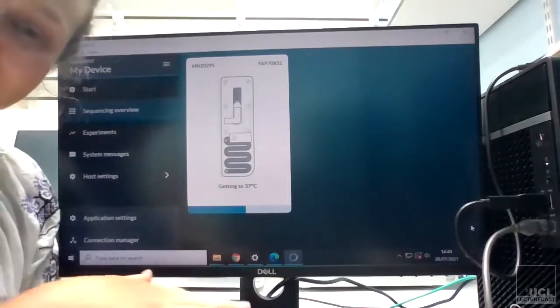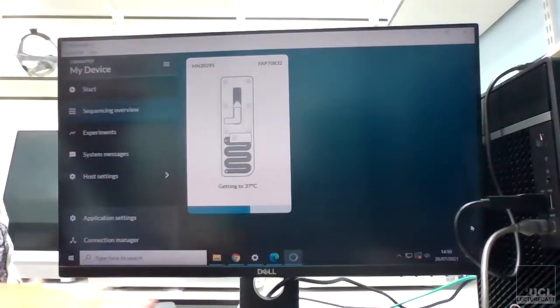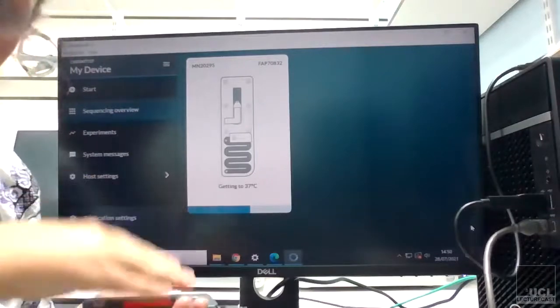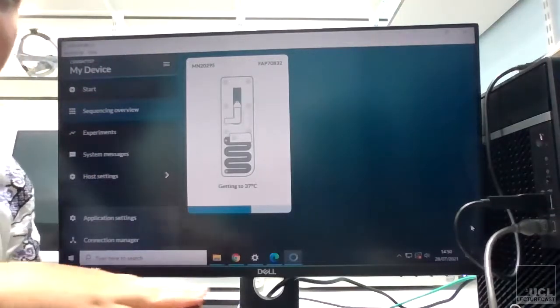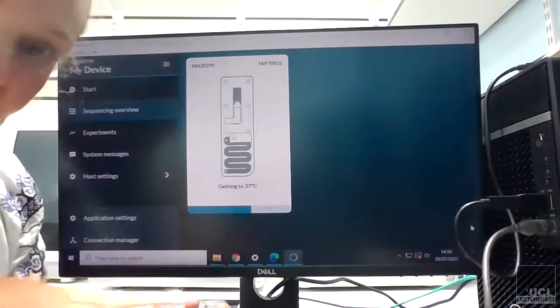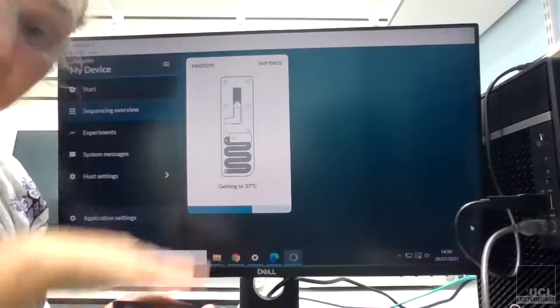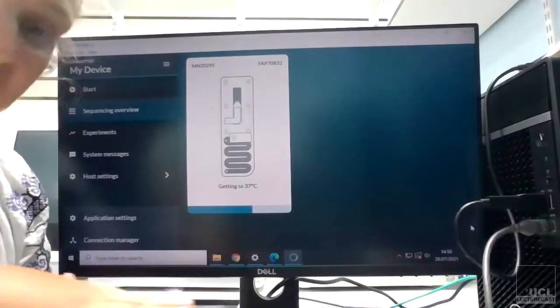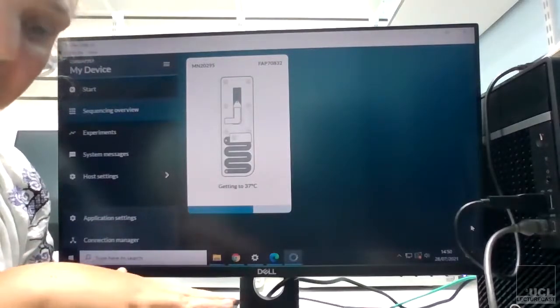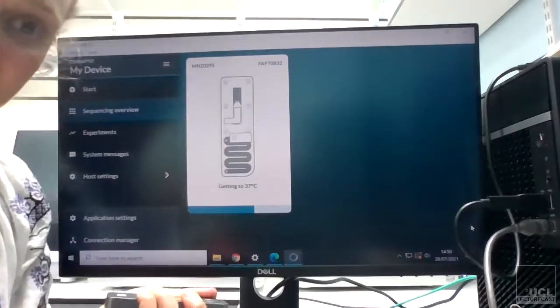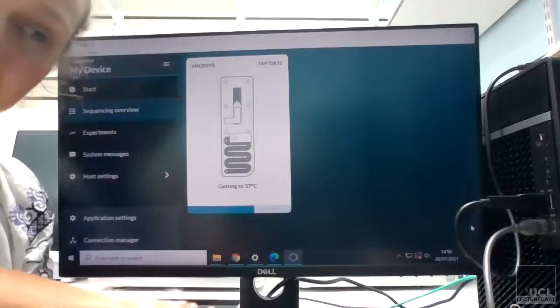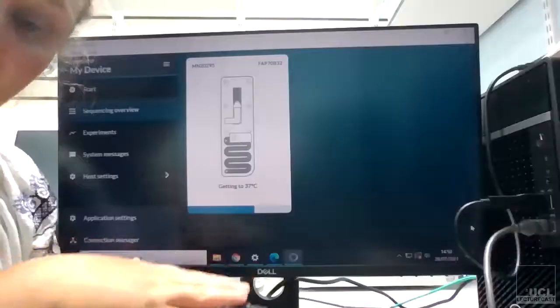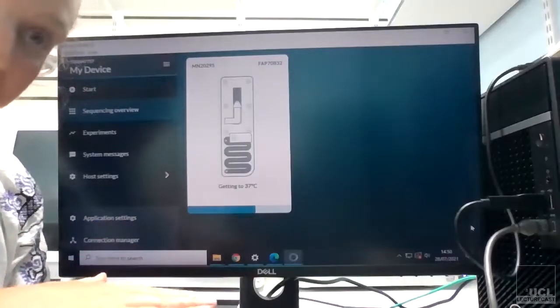So I sometimes find if I QC—so we've got two computers here—and I find if I QC it on one computer, it doesn't recognize that the flow cell has been QC'd if I do it on the other computer. So you might have to factor that in when you do your run, because the last bit of the protocol when you're loading the flow cells and stuff is quite time precious.